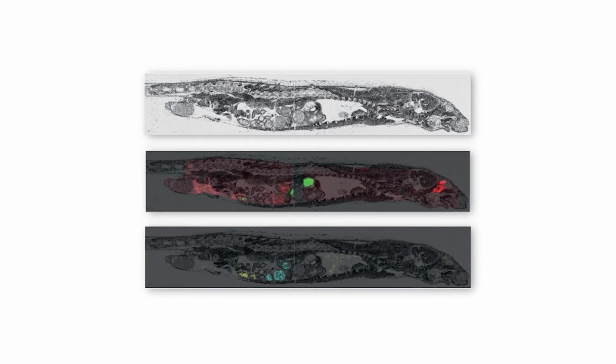So the stained tissue can be scanned into a microscope, read into Bruker's Flex imaging software, and then the mass images can be directly superimposed on the H&E stain or histologically stained tissue. This allows the researcher to be able to directly correlate certain mass signatures to histological features in the tissue.